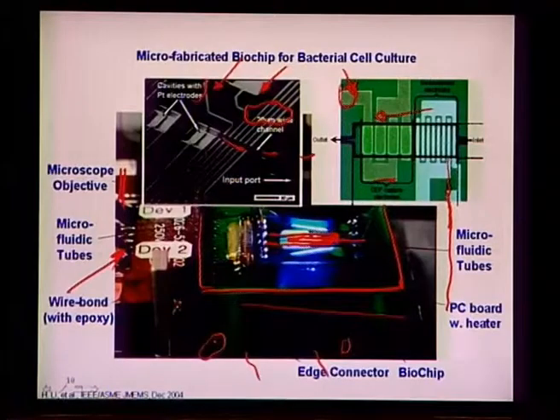So, it is a control system that we want to design here to thermally cycle. As you already know, PCR is a thermal cycling process of 3 temperature steps. I have illustrated it many times before. There is a step of 95 degrees, a step of 55 degrees, and another step of 72 degrees, and this follows in succession. Here in this example, the control is provided by the RTD on the chip, and the heater embedded onto this PCB is responsible for providing the power.